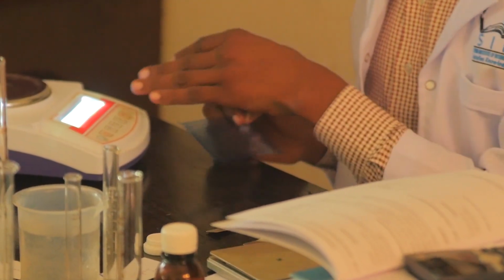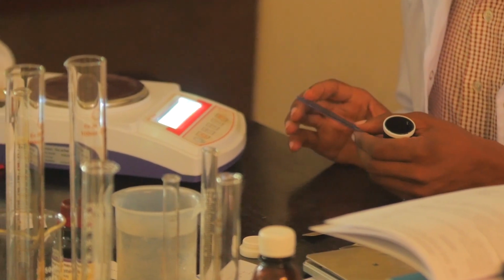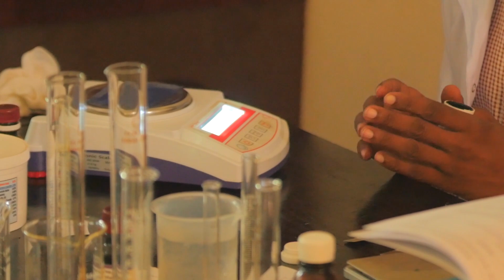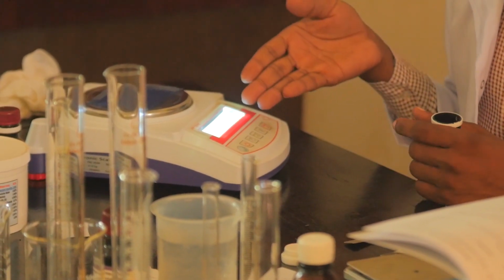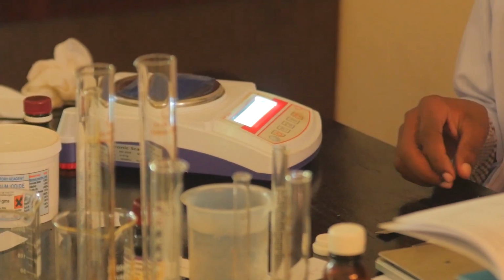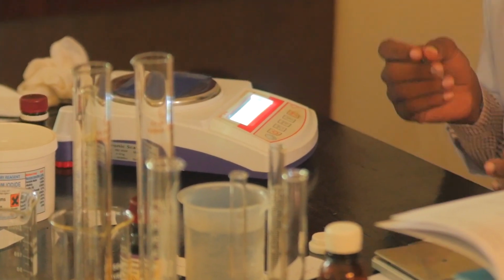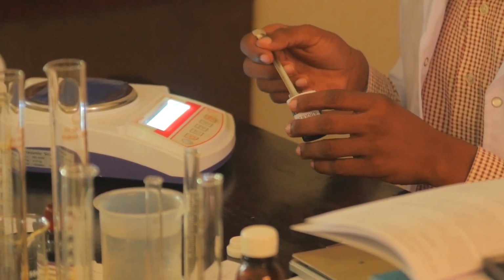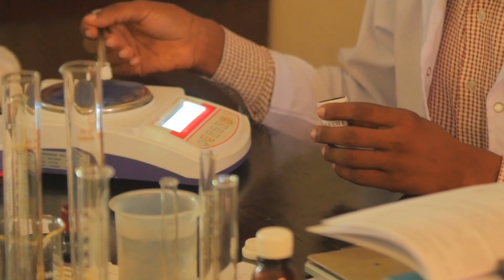So make sure your balance leaves 0 on the display. Then put your X-ray film to cover your balance. Now this is the weight of your X-ray film. Then tare to 0 to neglect the weight of this film. Now using your spatula, you can weigh 0.5 grams of potassium iodide.